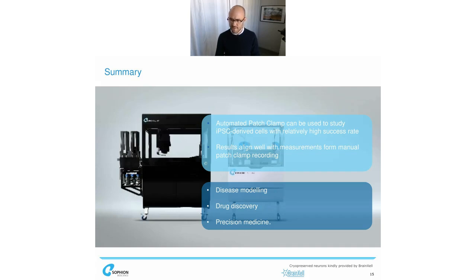With this, I only have one slide left, and I hope that I was able to convince you that there has been tremendous progress with the iPSC-derived cells on automated patch clamp, and we do believe that this technology has now matured to a state where it can be readily used for the drug development process. We are excited to see what the field will use this technology for. We get a lot of requests already from our customers, and there's interest in this. We see that there are possibilities for disease modeling. It can be incorporated in drug development processes, but there's also a big chance for precision medicine, we find.